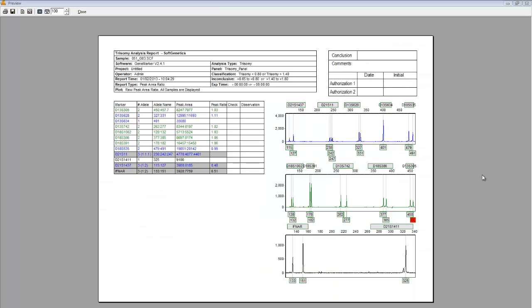This is a typical print report. The report contains a header with project-specific information, such as the sample name, analysis type, panel name, and project name. User management is also integrated into the report. The username of the analyst is included, as is the organization name. In this case, I'm logged in as the administrator, and my organization name is SoftGenetics. The relevant marker information from the report table is included, and markers in the trisomic range are highlighted.